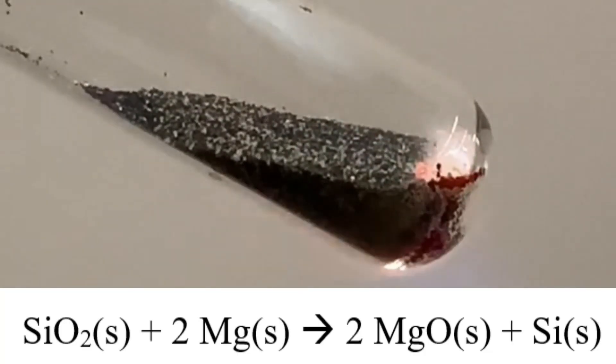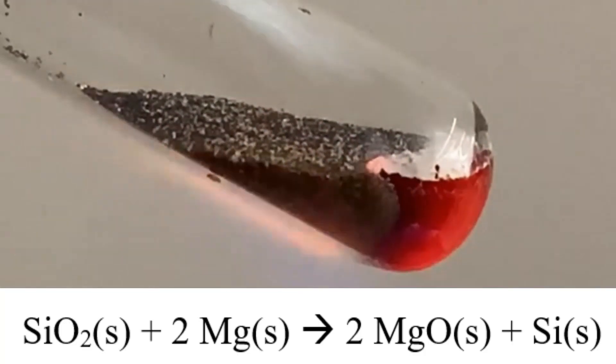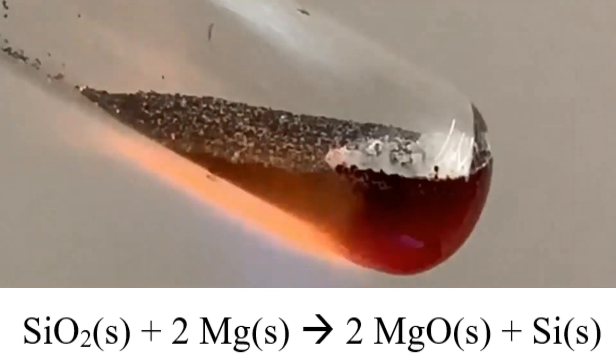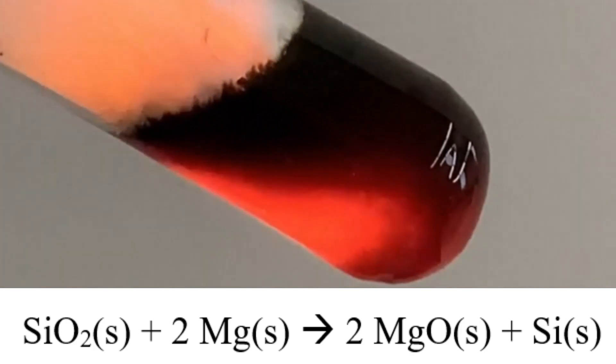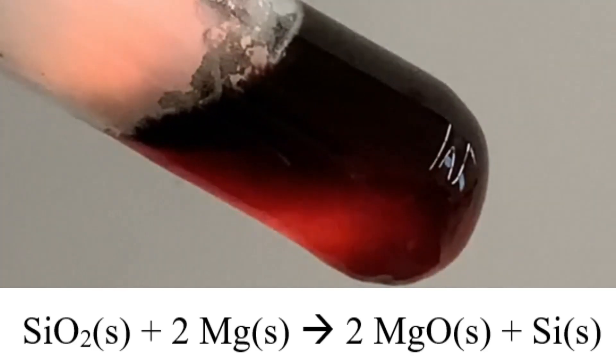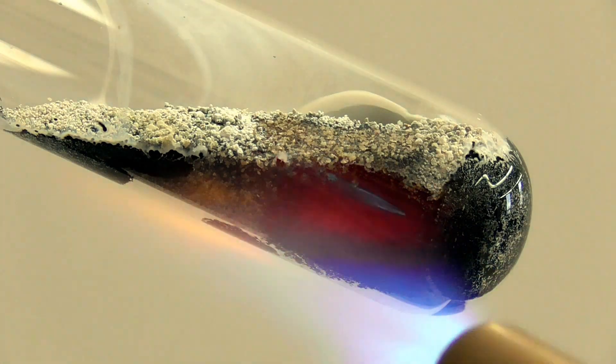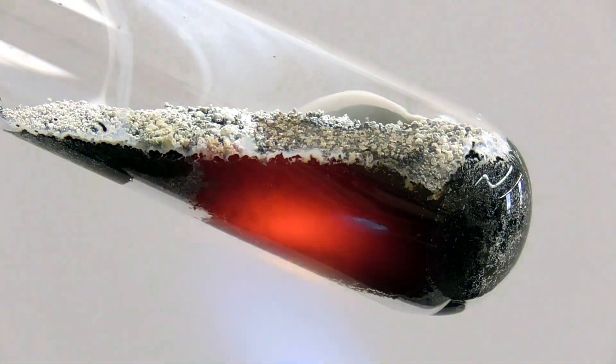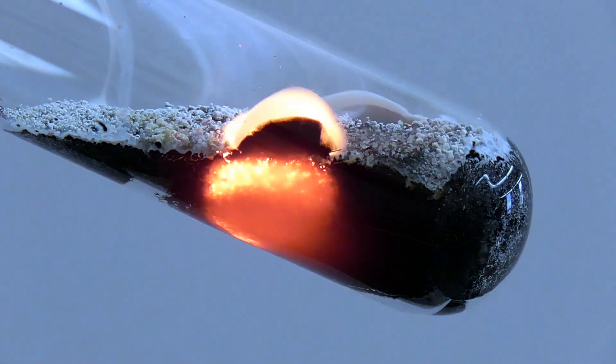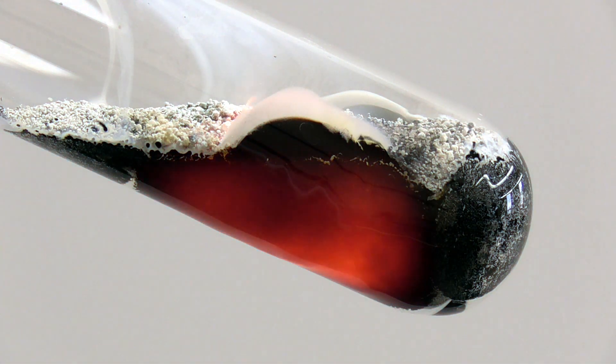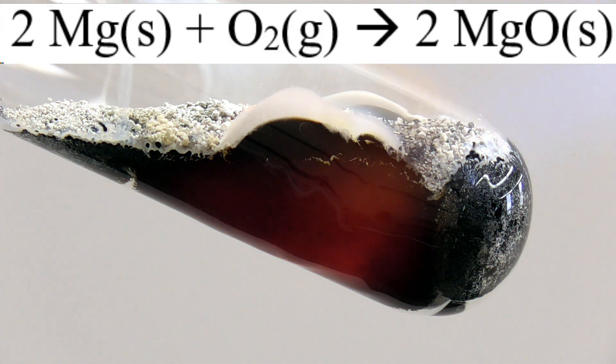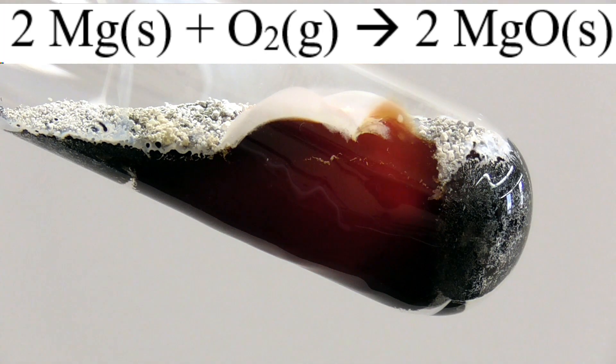Once the mixture gets hot enough, a chemical reaction takes place. In this chemical reaction, silicon dioxide reacts with magnesium metal to form magnesium oxide and elemental silicon. There are some other chemical reactions happening here too. You might notice a small amount of white product. This product forms as magnesium reacts with oxygen gas in the air to form magnesium oxide, which is white in color.